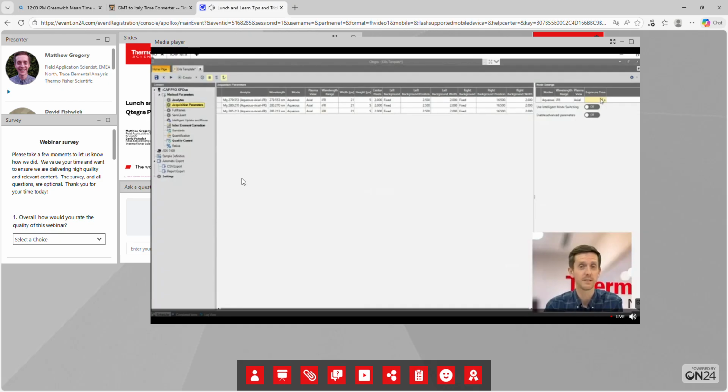This may be limited by the instrument you have, but typically if we increase this exposure time, we increase the achievable limits of detection. So 5 would be, for this particular model, the lowest we can go down to, but it may be that we want to increase this to 10 seconds, maybe even 15 seconds, to get some improvements in the limits of detection we require.